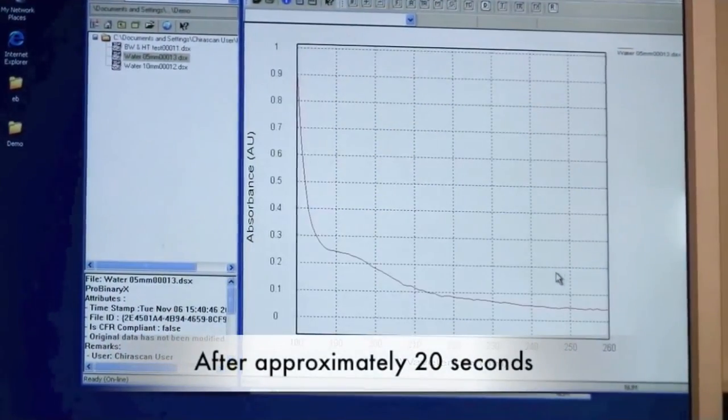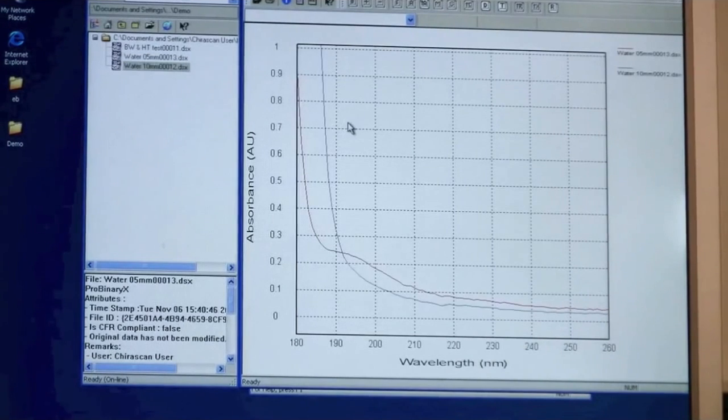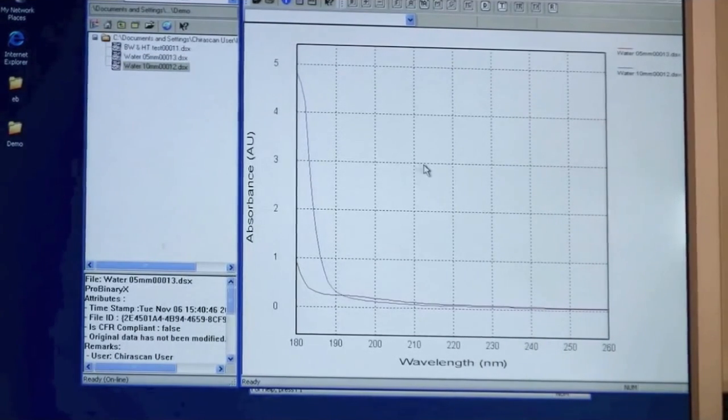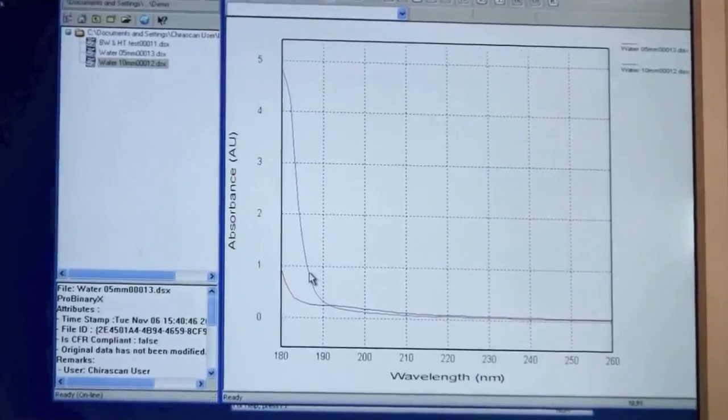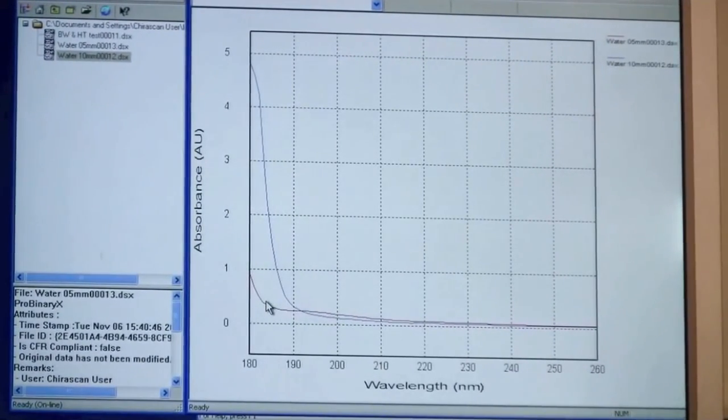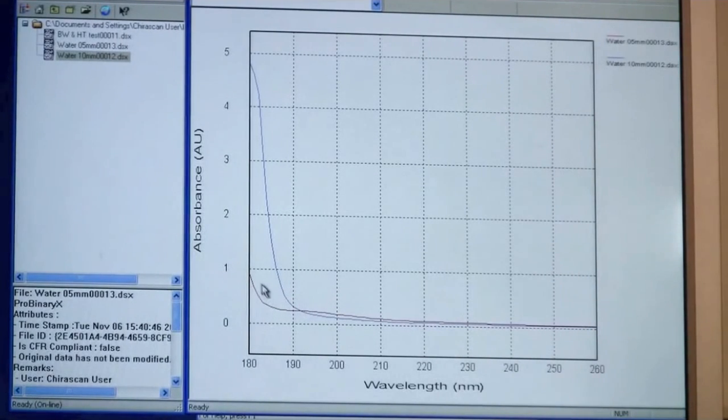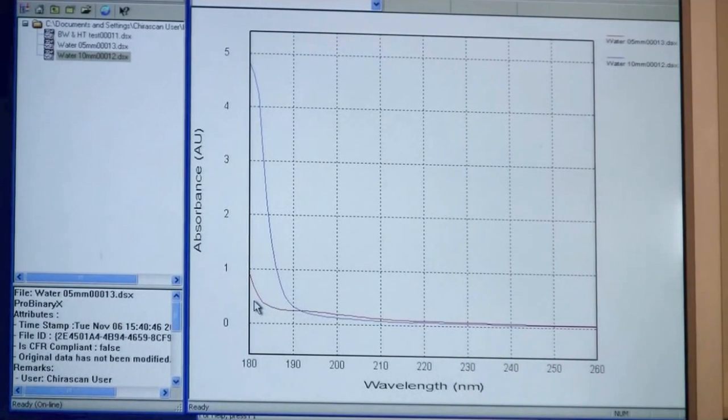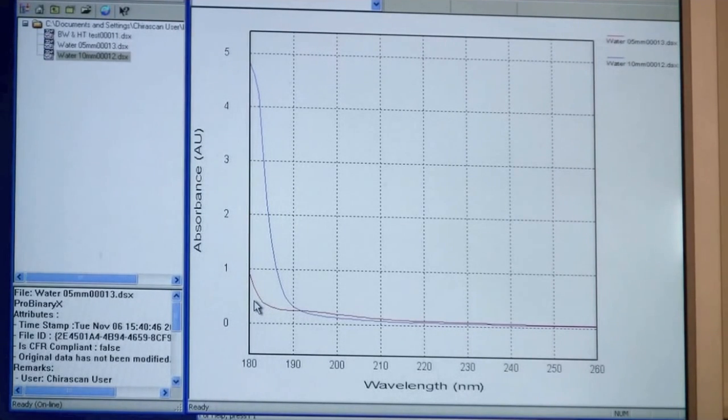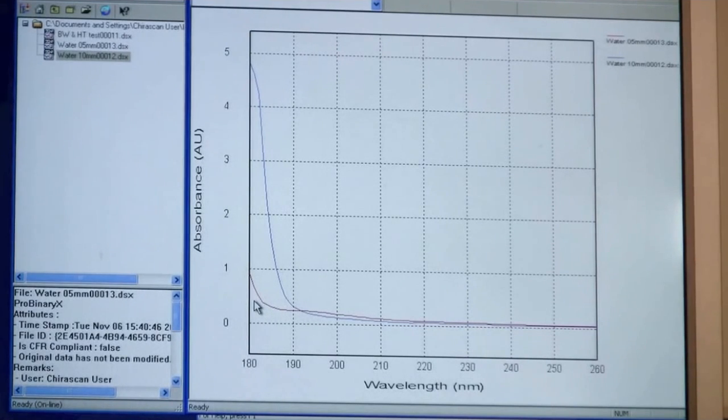When I have collected both traces I can now overlay them like this. So there is two things to notice here. The blue line is the 10 mm path length. The red line is the 0.5 mm path length. As you can see the absorbance is much less for the 0.5 mm path length. It means that using a shorter path length your buffer system will have a lower influence on your data and the likelihood of you to collect data far into the UV range is bigger.